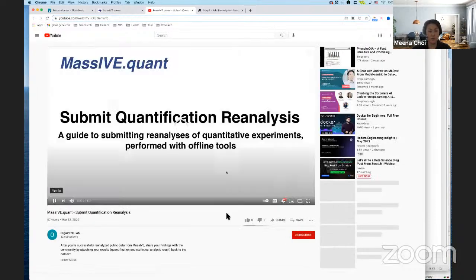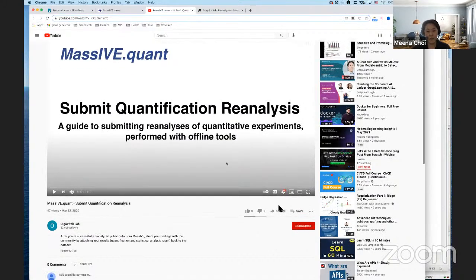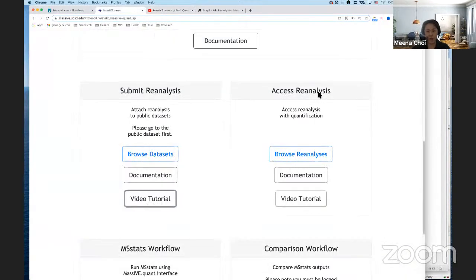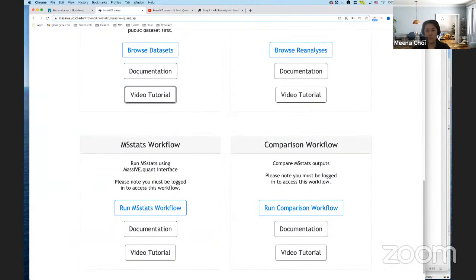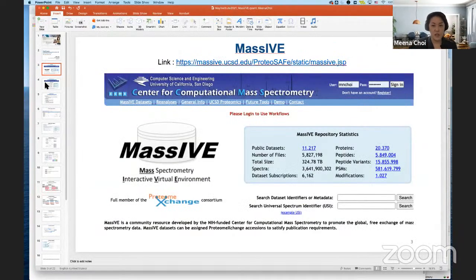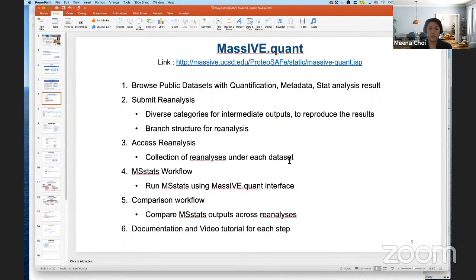I will just not play them. But on the Olga Vitek lab page, there are videos; for example, this one is for the reanalysis submission. I recorded my screen to show how you can submit a reanalysis. You can just follow each step over there, but I will go over it shortly today. So the first step: for MassIVE-quant, what we can do is browse the public data and submit the analysis.